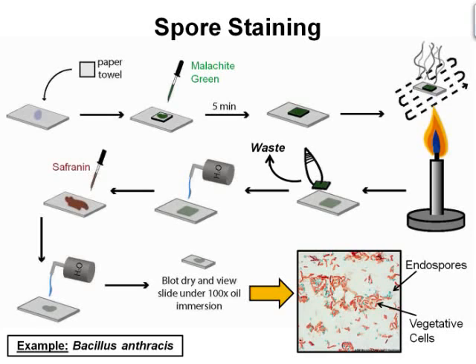The primary dye, malachite green, binds relatively weakly to the cell wall and spore wall. In fact, if washed well with water, the dye comes right out of the cell wall. However, not from the spore wall once the dye is locked in. That is why there is no need for a decolorizer in this stain. It is based on the binding of the malachite green and the permeability of the spore versus cell wall. The steaming required in the procedure helps the malachite green to permeate the spore wall.